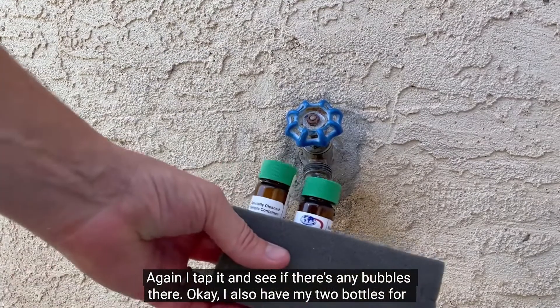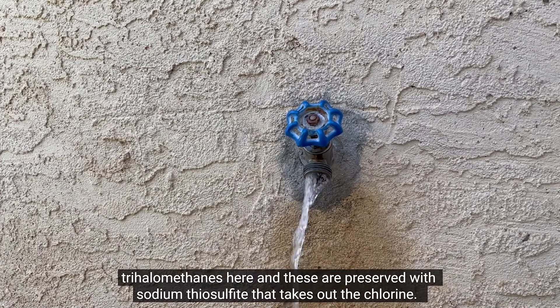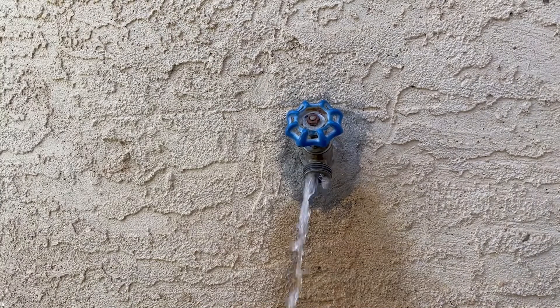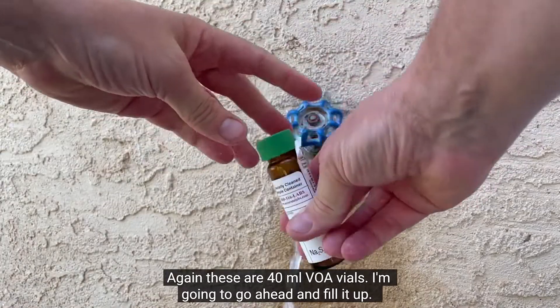I also have my two bottles for trihalomethanes here. These are preserved with sodium thiosulfate, which takes out the chlorine. These are 40 ml VOA vials.